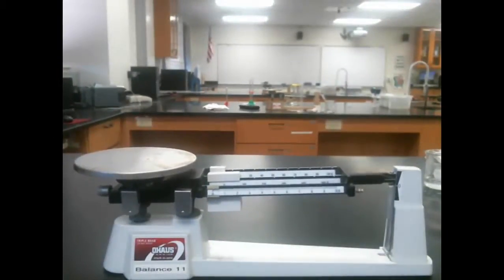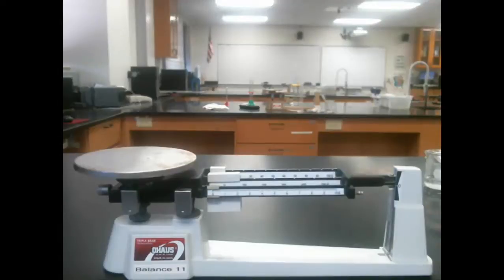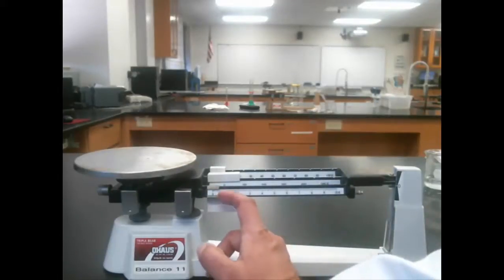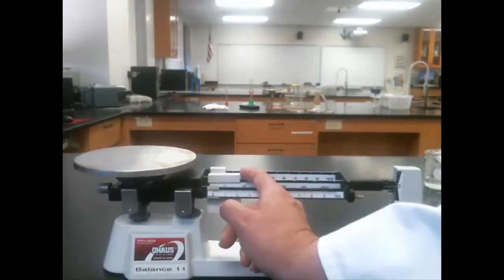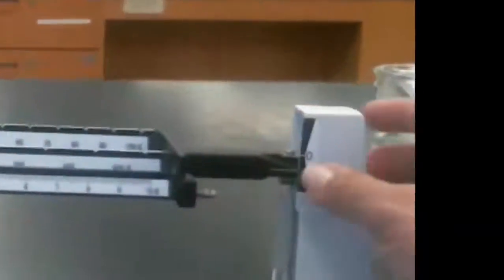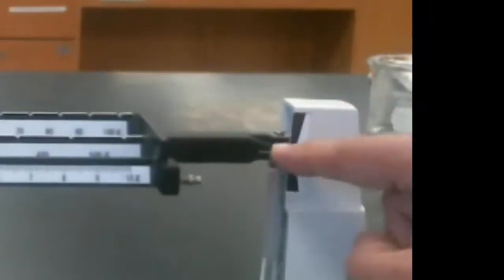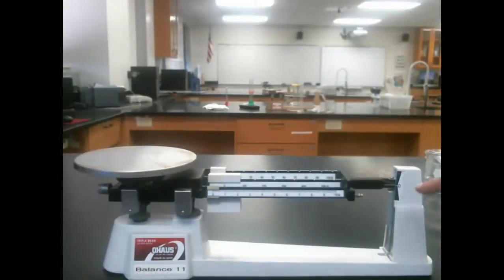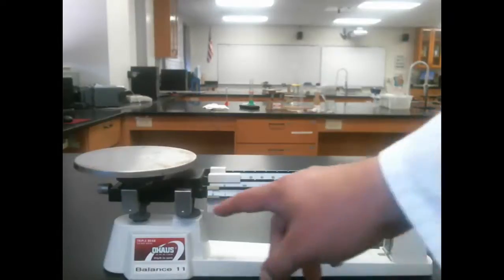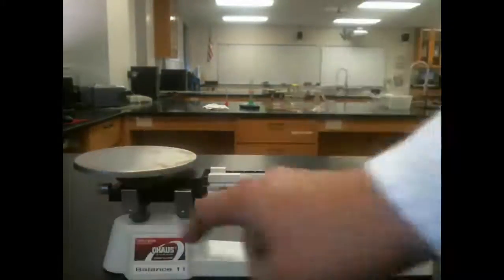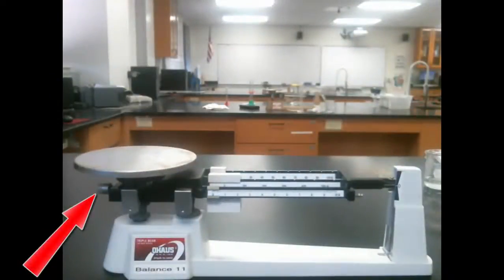Before you use the triple beam balance, the very first thing you want to do is make sure that the balance is actually calibrated correctly and zeroed out. That means that when all of the weights are back here at the zero position, this line on the balance arm should match up with the line on the zero on the balance base itself. If it's not, and this looks like it might be just a little off, you can adjust this slightly by using a little knob underneath the balance pin that turns clockwise and counterclockwise and allows you to change this zeroing.